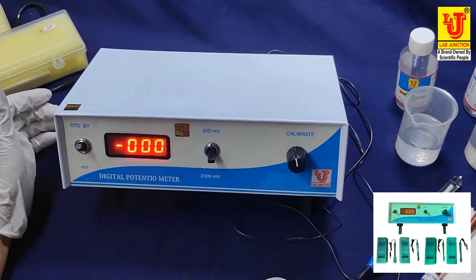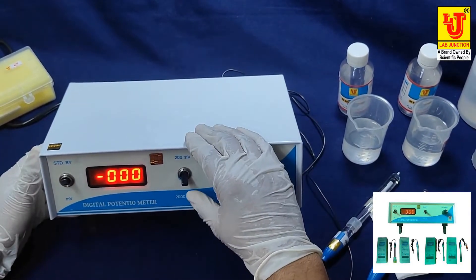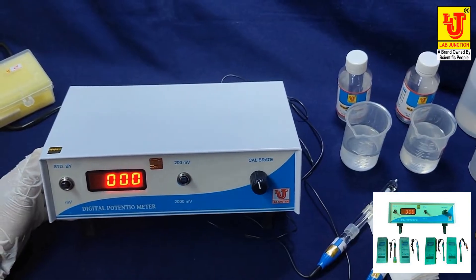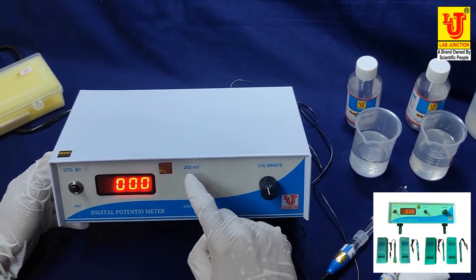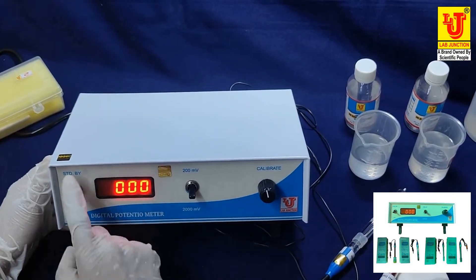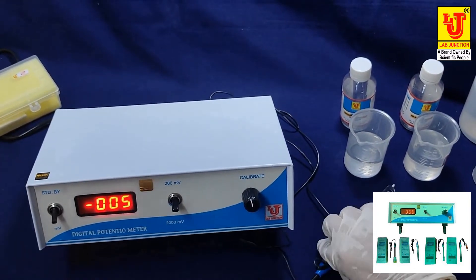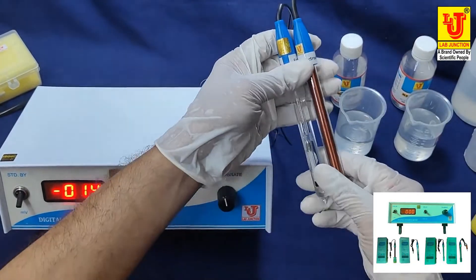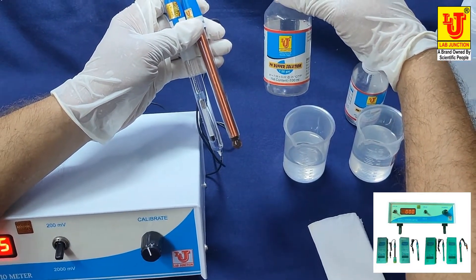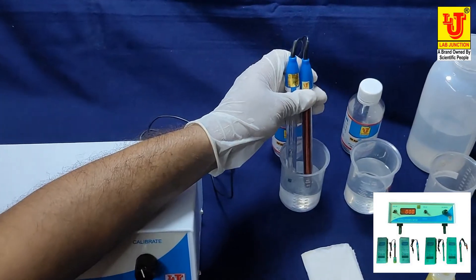This is the calibrate control and this is the range control. If you want to do measurements less than 200 millivolts, turn to 200; if above 200 millivolts, move to 2000 millivolts. This is the standby mode showing triple zero. I am moving to 2000 millivolts. Take both electrodes and dip them in the 7 pH buffer solution.